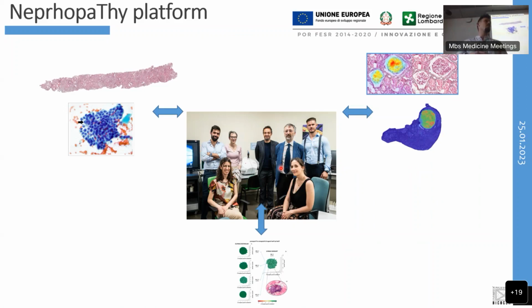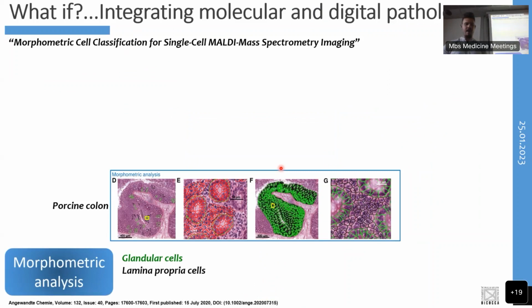And again, based upon my knowledge of what I see in the field of mass spectrometry imaging, this is quite a novelty, also on a global level as well. There aren't really these type of platforms that have been set up. So I think it gives us a really great opportunity to really try and push this technology closer towards the clinics. And I have 2 slides which remain.